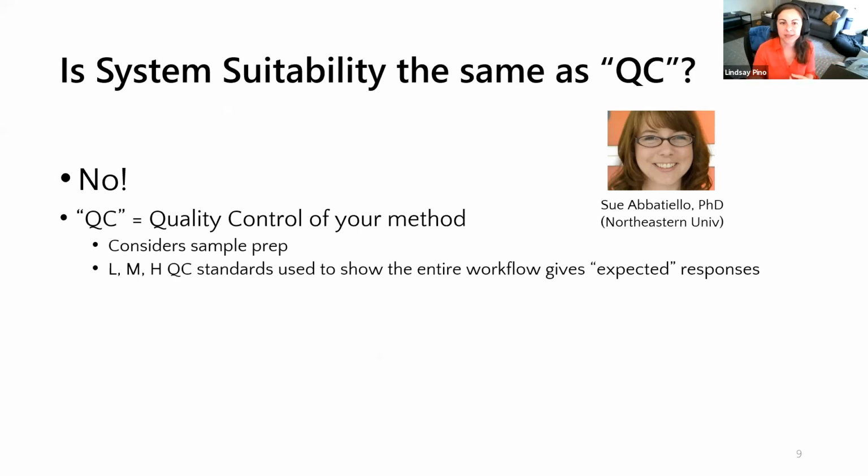A lot of times, if you're in mass spectrometry proteomics, I see a lot of you I recognize in the mass spec proteomics community, we use an isotopically enriched standard, so a heavy standard, a stable isotope labeled standard, where one standard is a light distribution, so kind of endogenous isotopes in the sample.